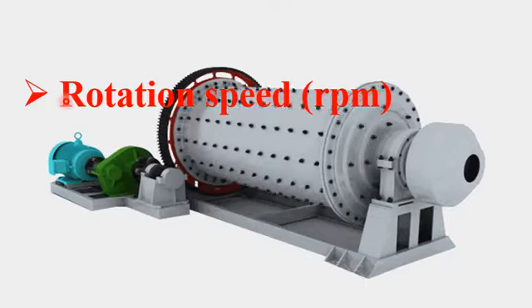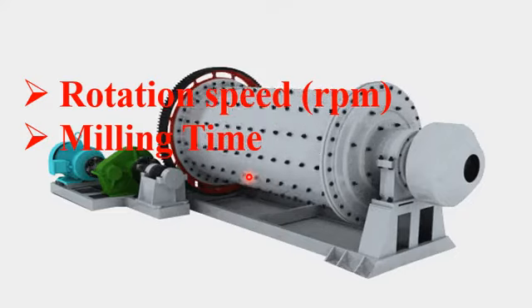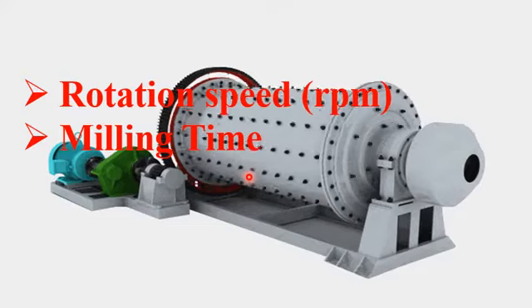Another key parameter to consider in a ball milling apparatus is milling time. Dear student, usually if the milling time is higher, there is a possibility of getting fine nanoparticles.